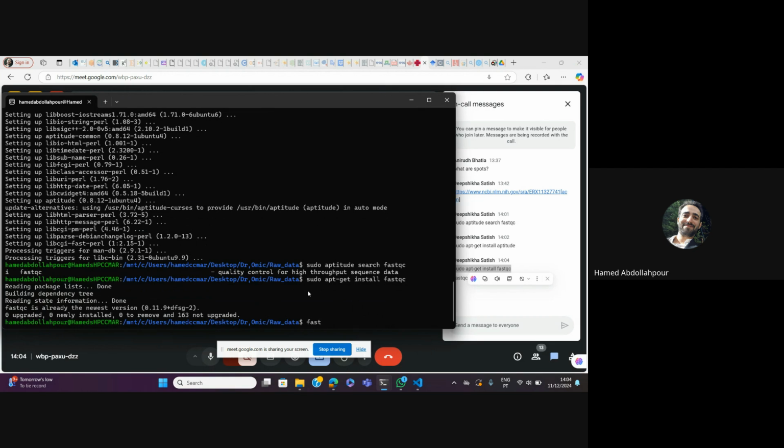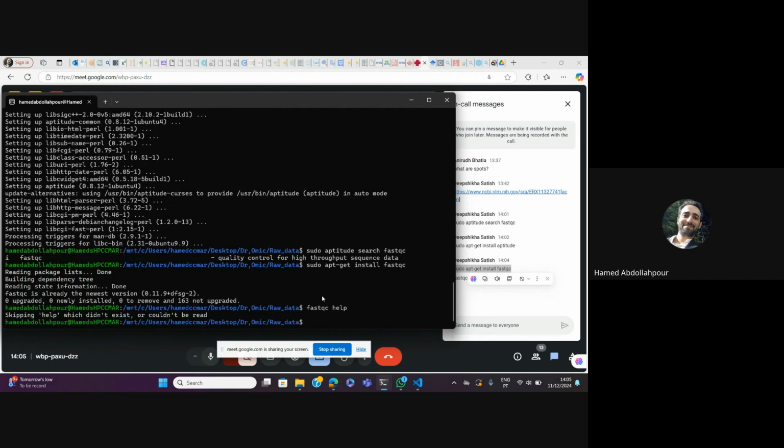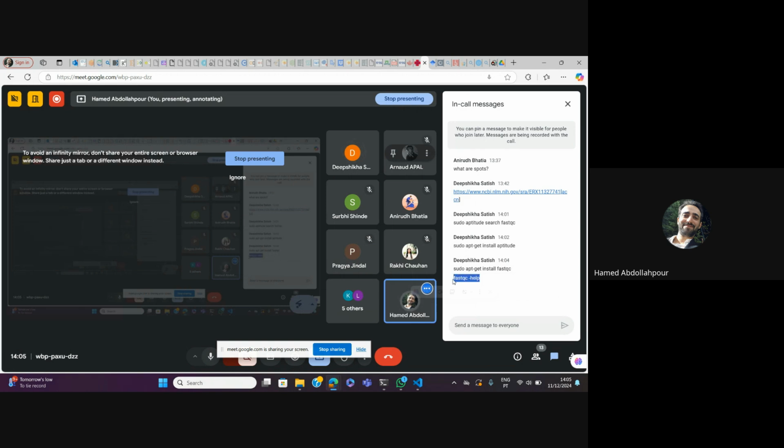Not this, sir, hyphen. Just copy that command from the chat, sir. Yeah, it's much better. Thank you.